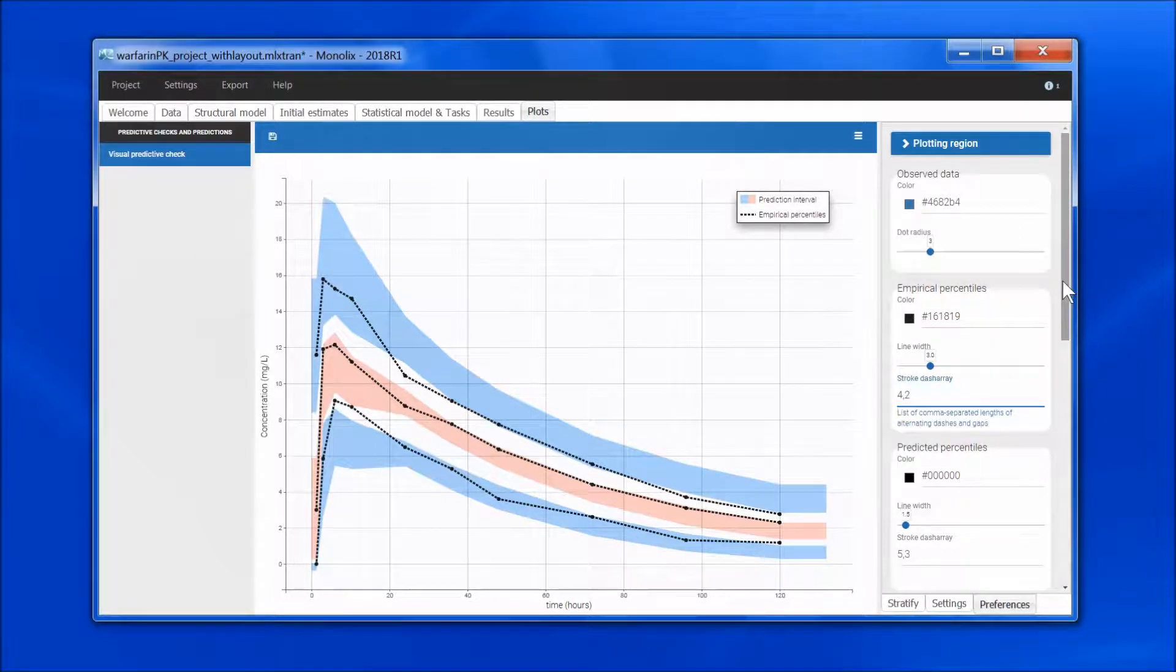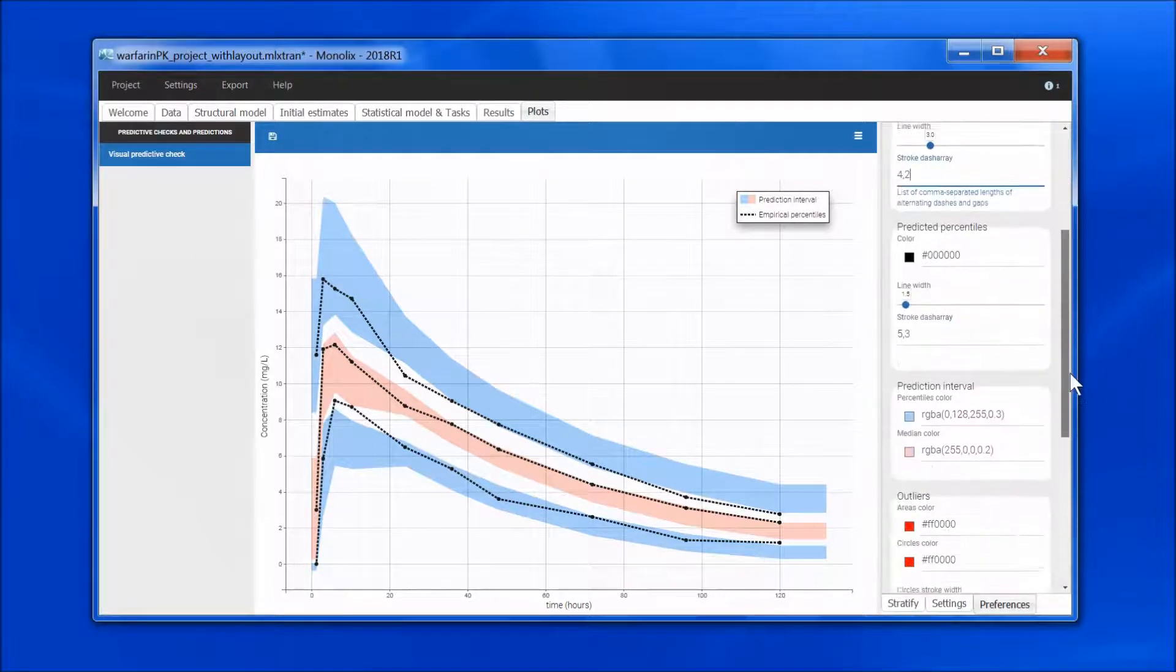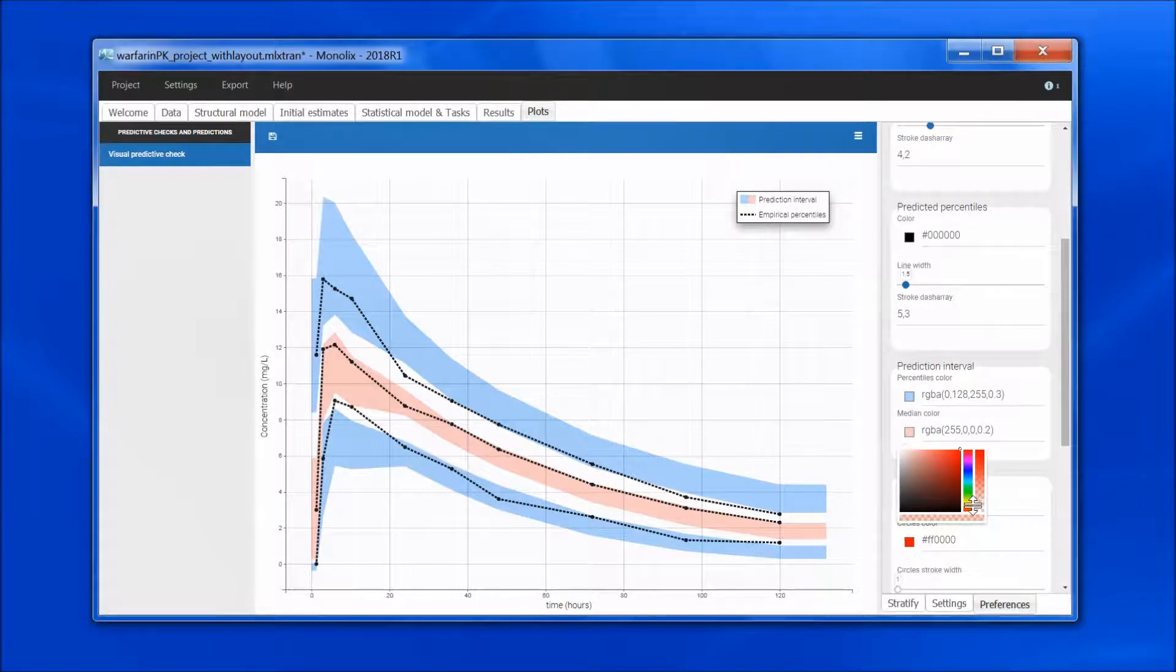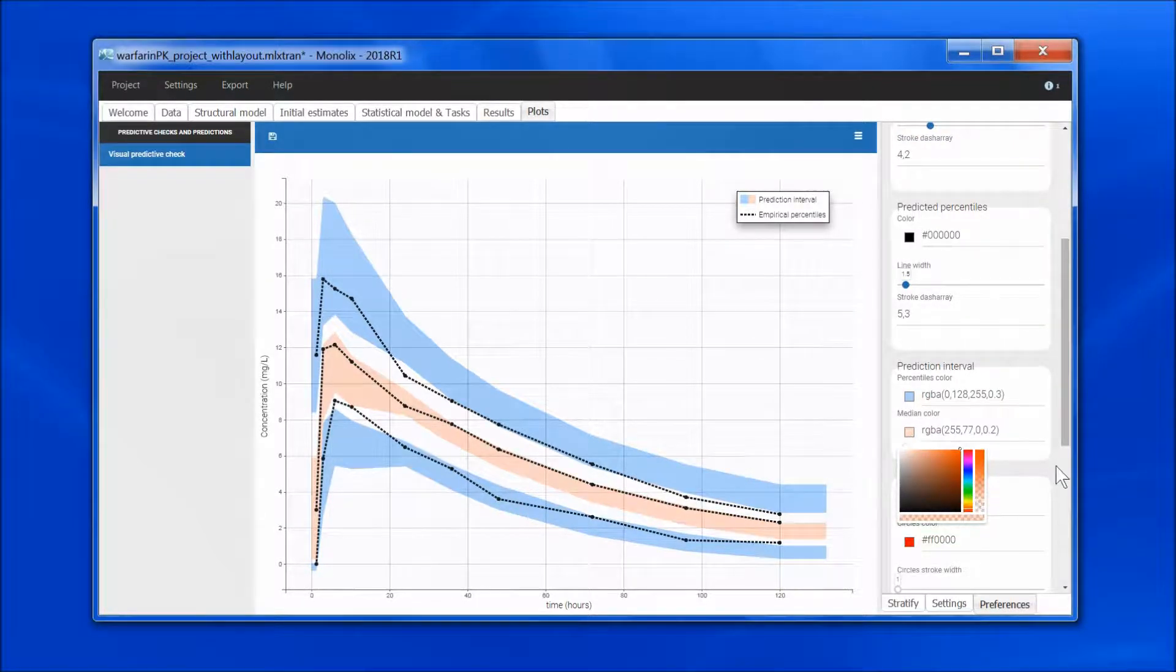For the color of the prediction interval, I will change the pink to something more orange for instance.